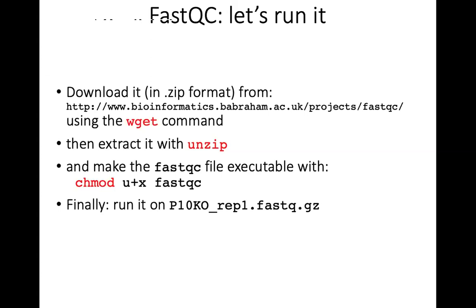If your terminal is a bit bigger... It's because the PATH variable is quite a variable. What you should have put there is actually FastQC. Otherwise, you can directly use the full path command, but then you would not have to use the PATH variable. Yeah, it's running that.